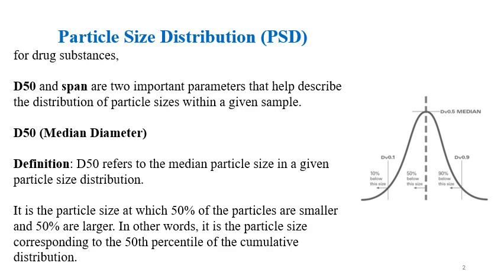Always understand that a powder is made up of a number of particles with different sizes. So to understand the data of PSD, we need to understand D50 and span.